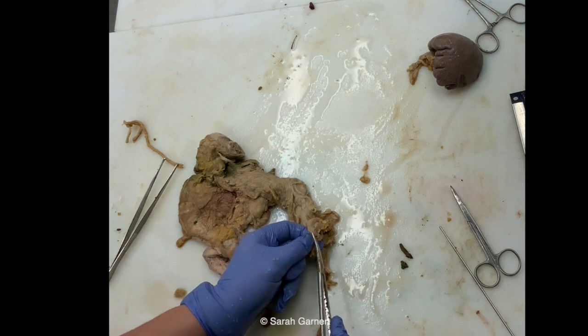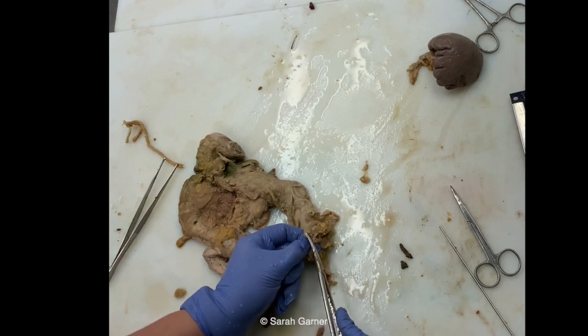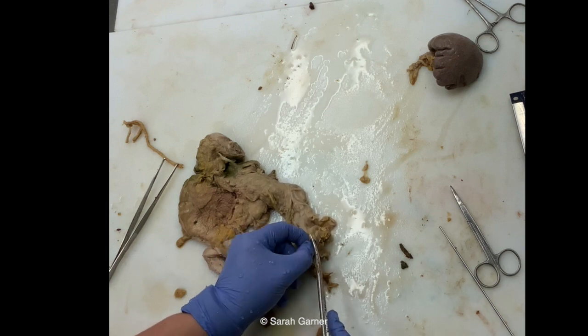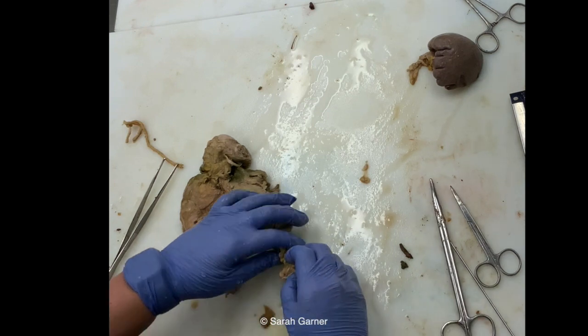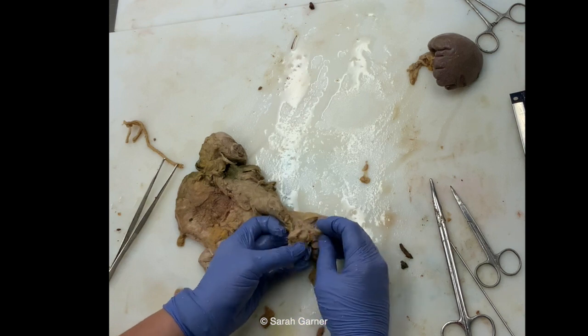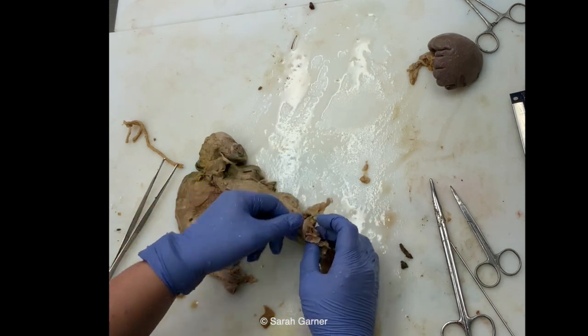This is your splenic artery because it's just a little bit superior, and it's also got that curly Q shape, tortuous, and a little bit thicker wall. So you can see how tortuous it is. I love the splenic artery so much. Here you can see it twisting around. So it's pretty cool.